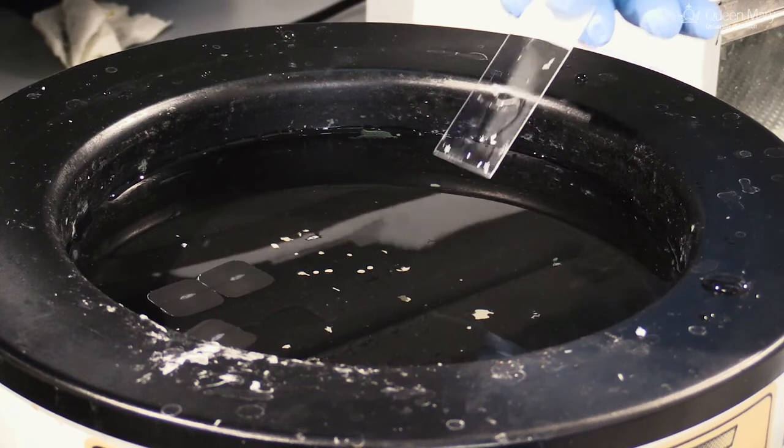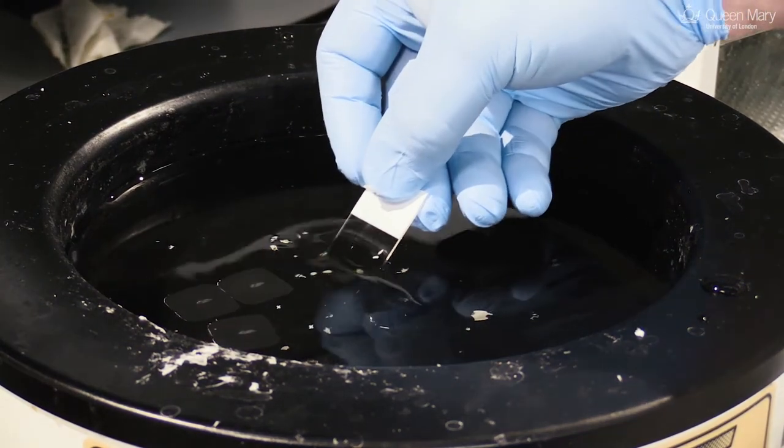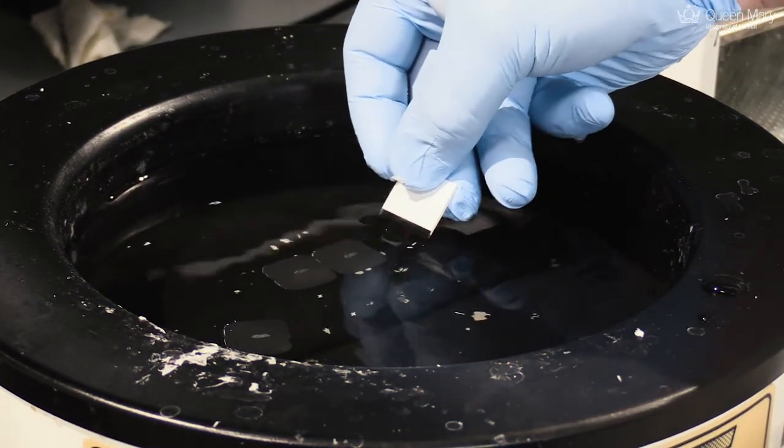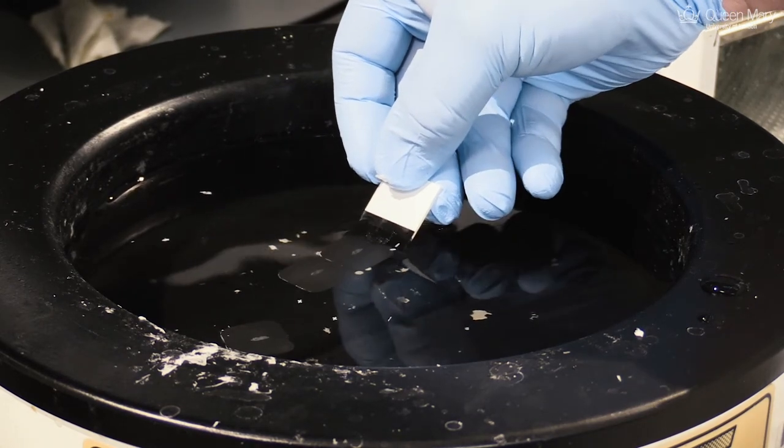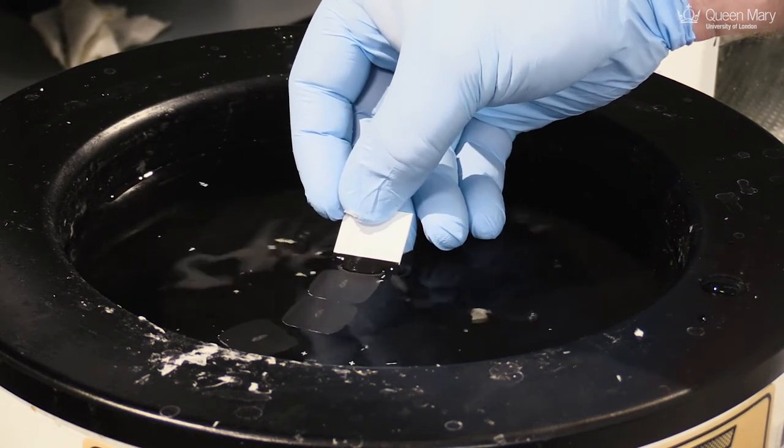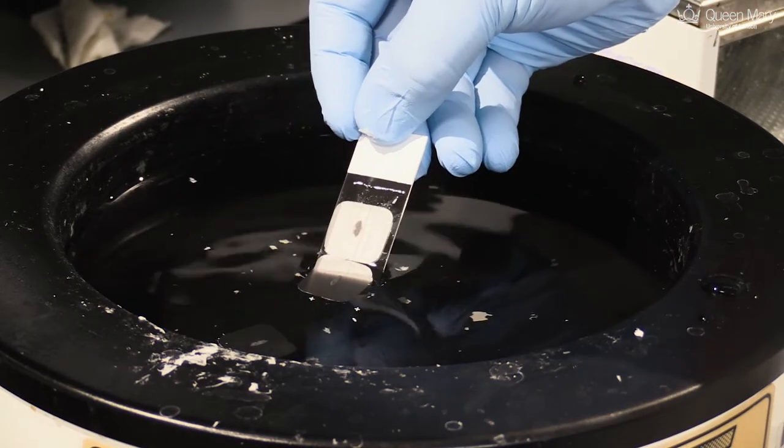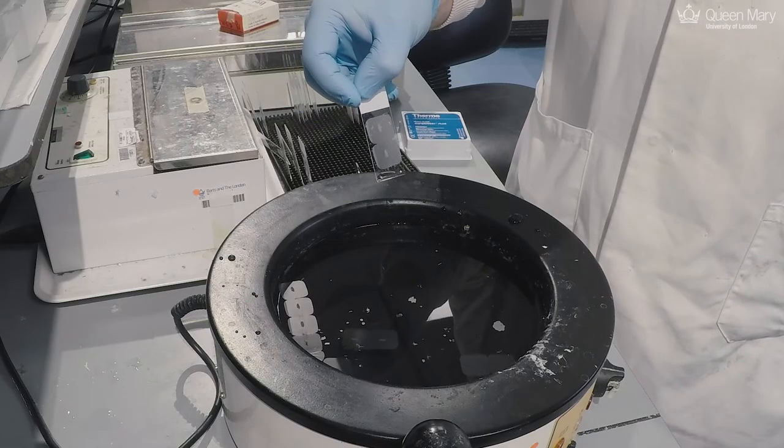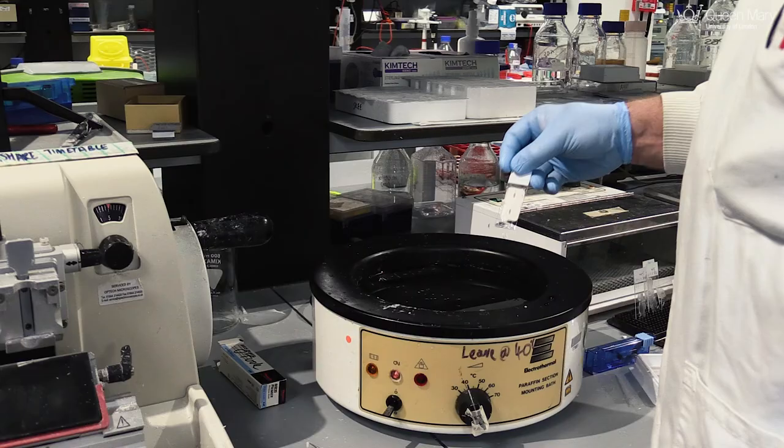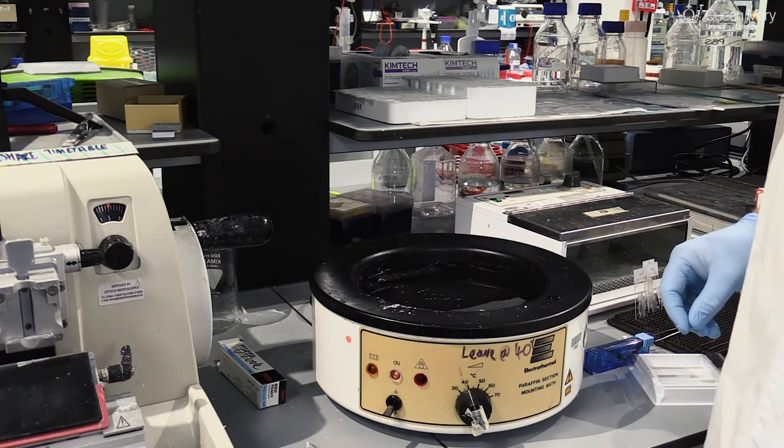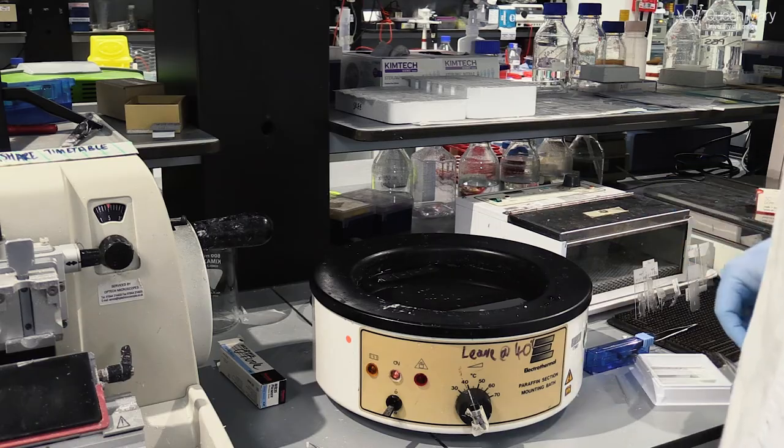These are actually coated microscope slides. We put them in underneath the section, allow the section to touch, and then pull them up. So we've got our nice thin tissue sections stuck to our microscope slide, ready for the next step, which would be staining and then imaging.